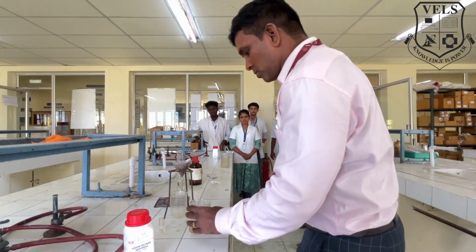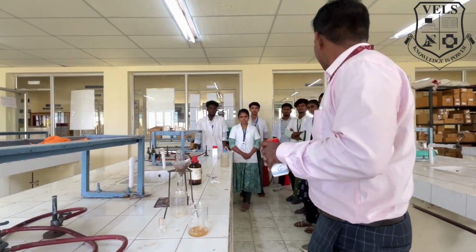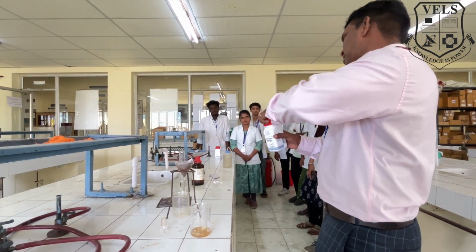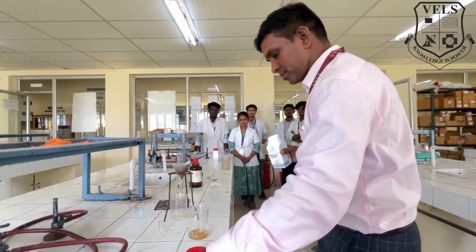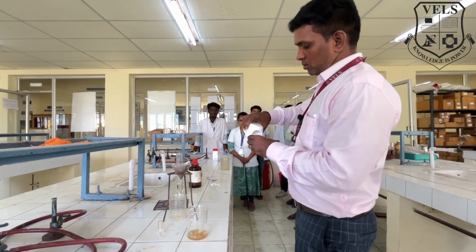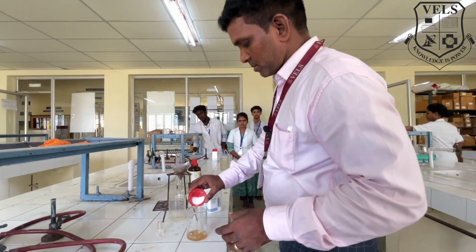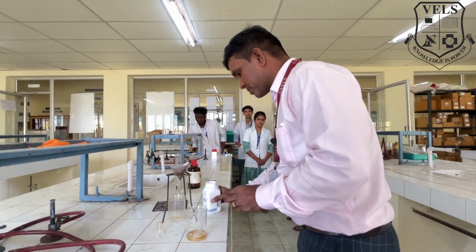To remove the moisture from this solution, I am going to add a little amount of sodium sulfate, which is a dehydrating agent. Take some sodium sulfate and add it in this solution.